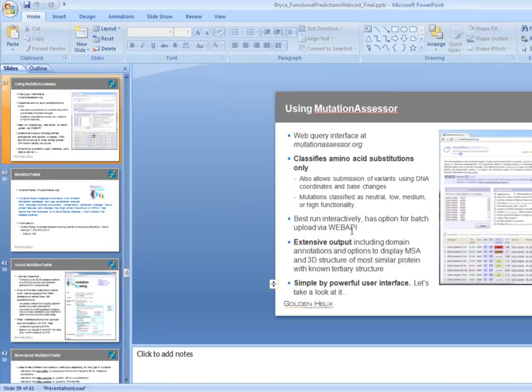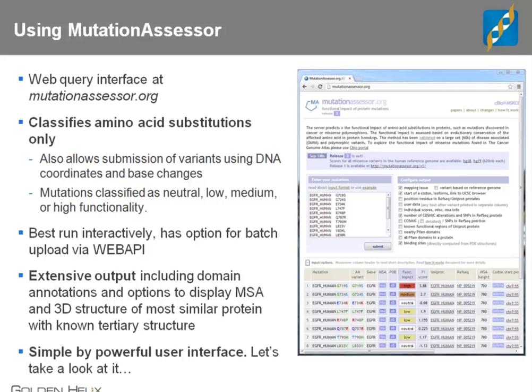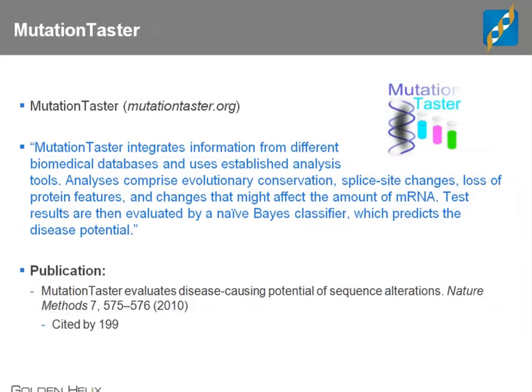So let's come back now to our slides and move on. The next one we'll look at is Mutation Taster, and we'll just quickly review Mutation Taster.